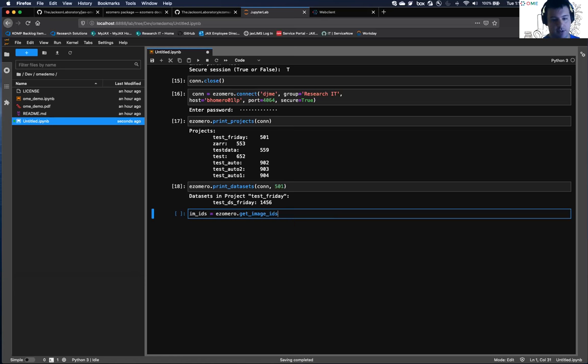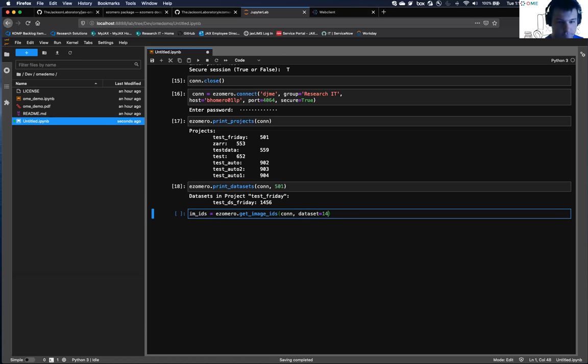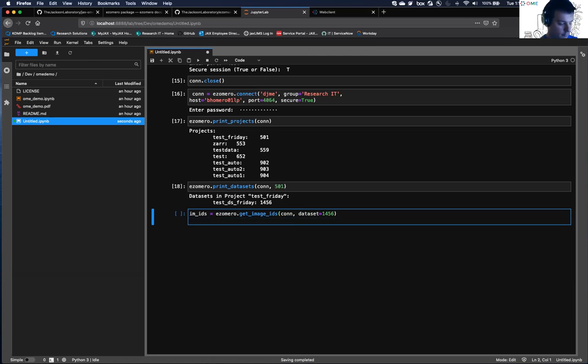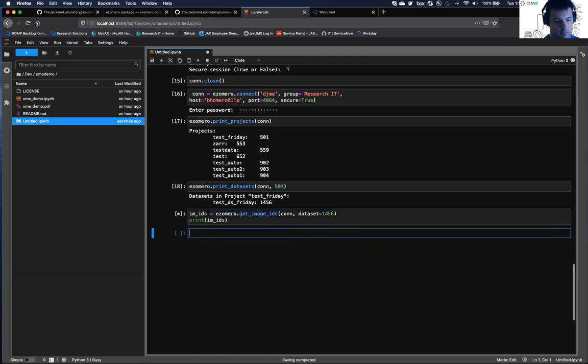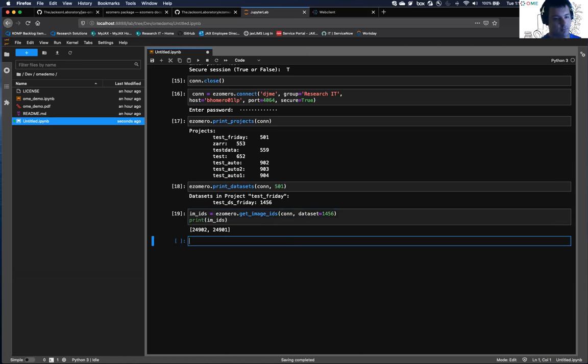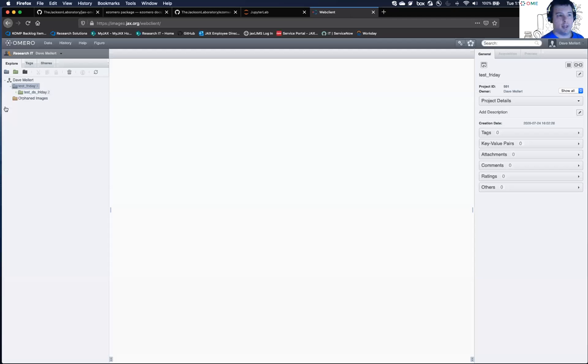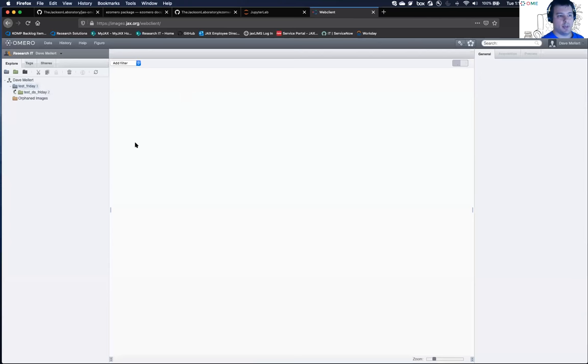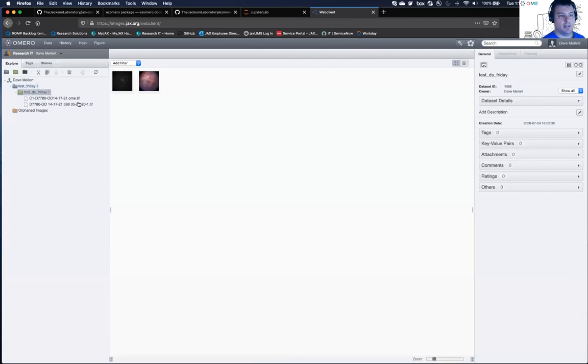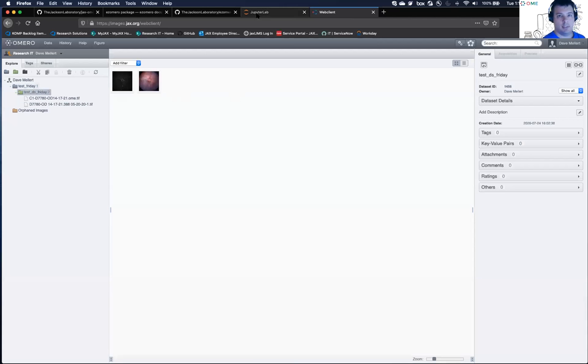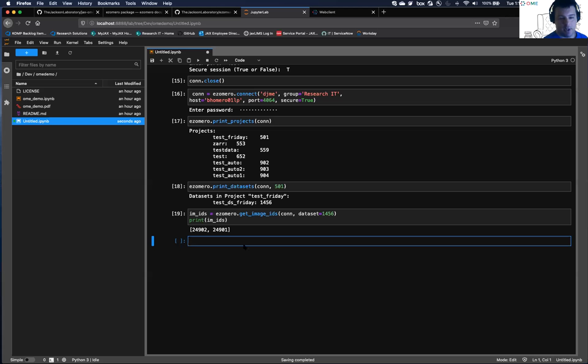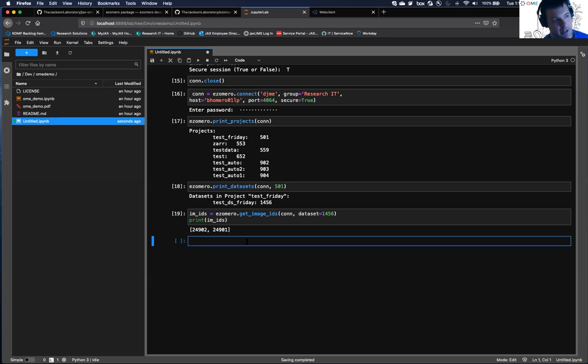And then you can grab, say, image IDs from that dataset. So here we have get image IDs. So I have two images. If you look in OmeroWeb, you can see there's my project and dataset, and there's my images. I always wanted a simple way to browse around when I'm in the shell, rather than going looking back and forth with my browser.